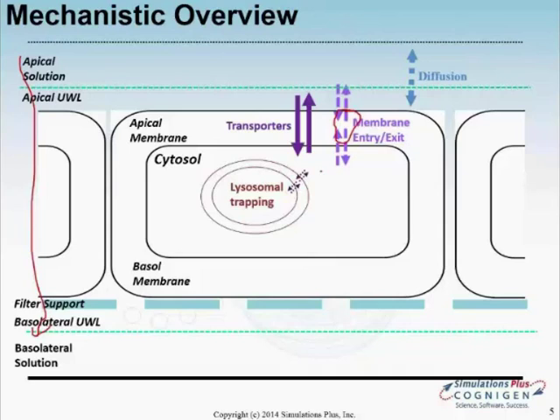So again, it's a process that you are able to explore a little bit better with this software. We have an option to account for possible metabolism of the drug inside the cells. Depending on what kind of cell system you are using, you may have metabolism by some of the enzymes, so you can account for that process as well.